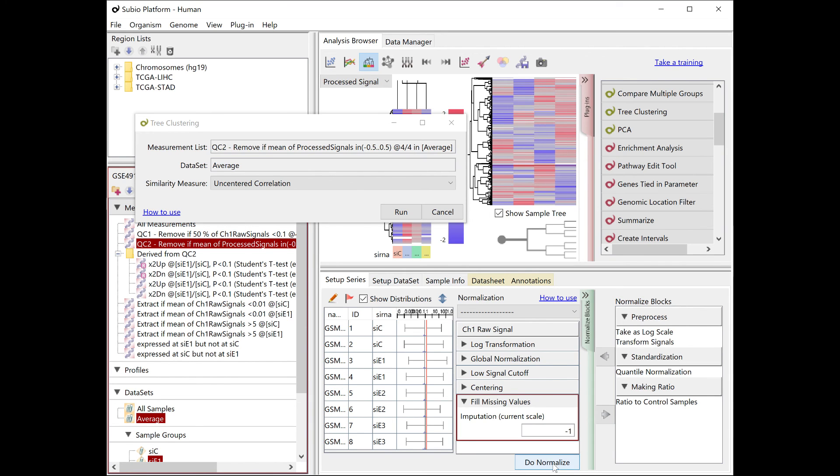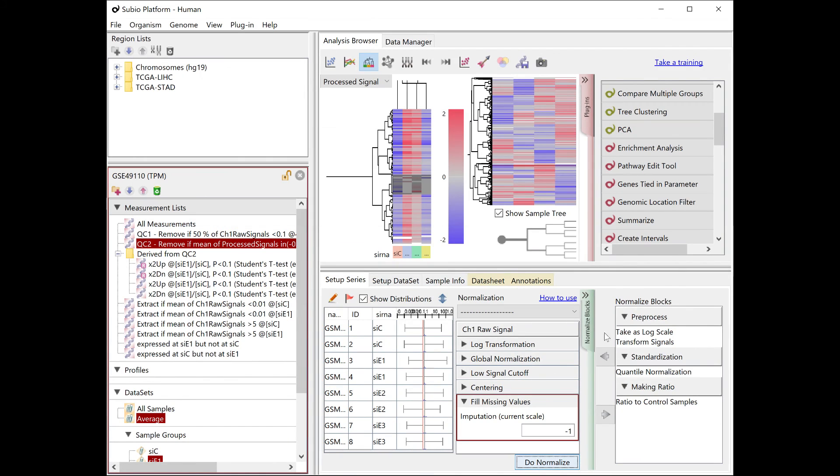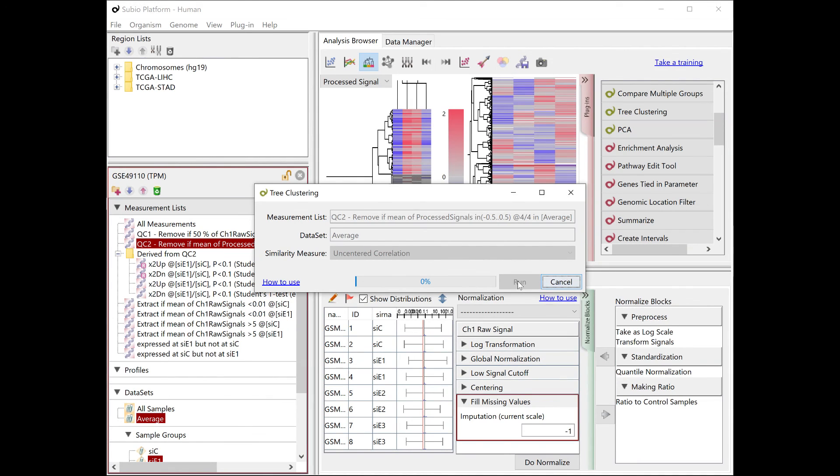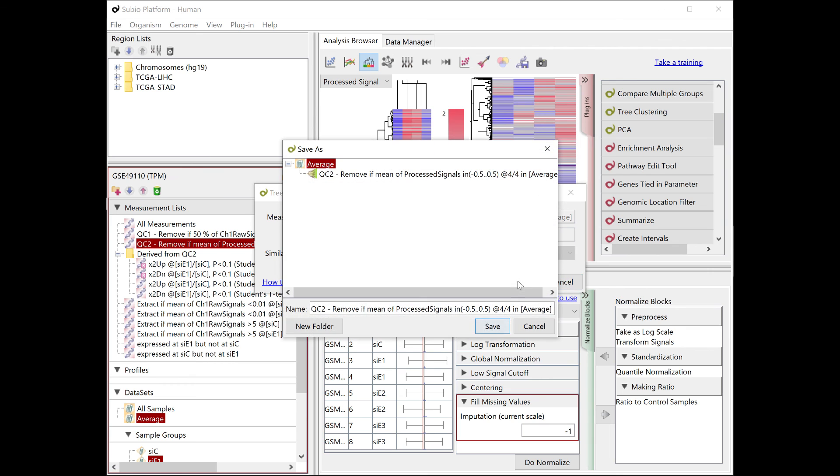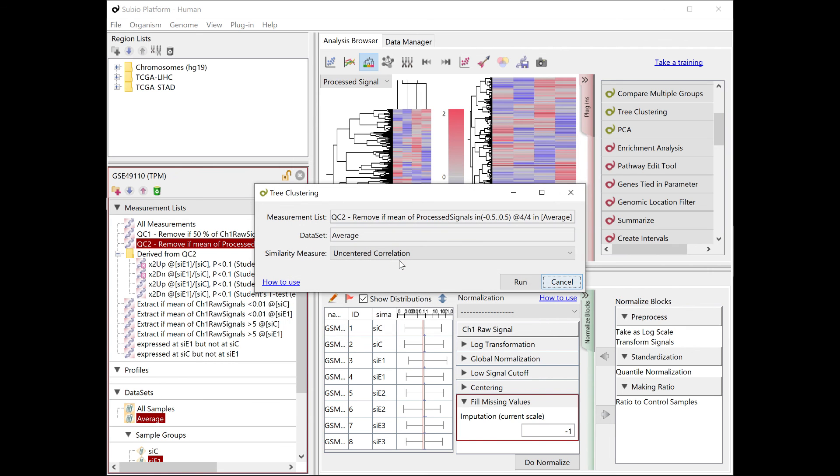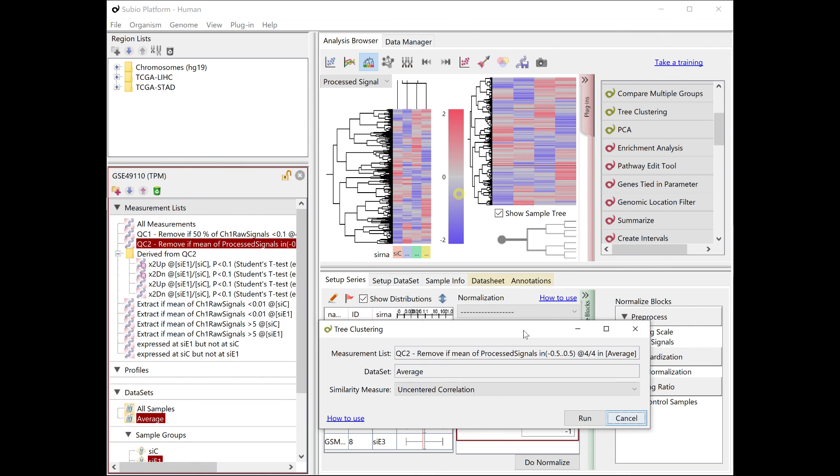Press the Do Normalize button to confirm and overwrite the processed signals. Redo the clustering on the new processed signal. This eliminates the missing parts in the heat map that you saw before.